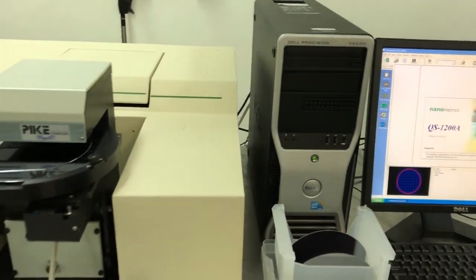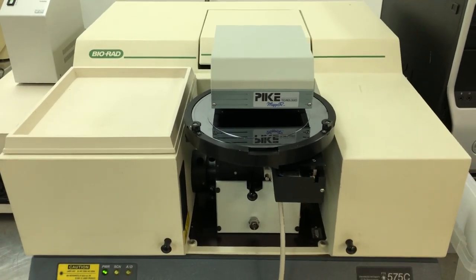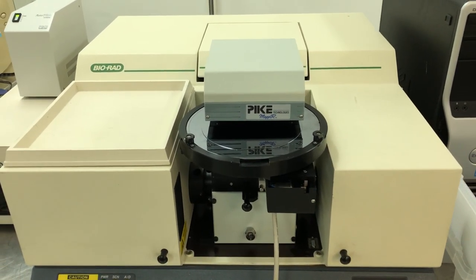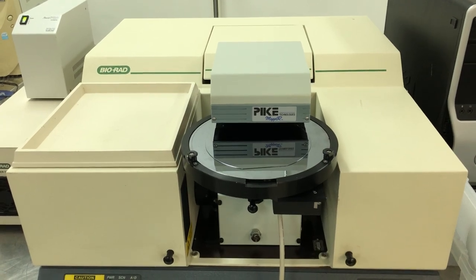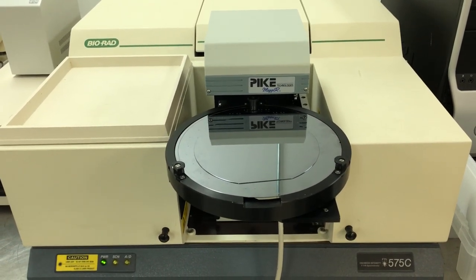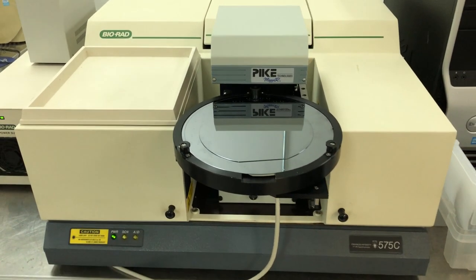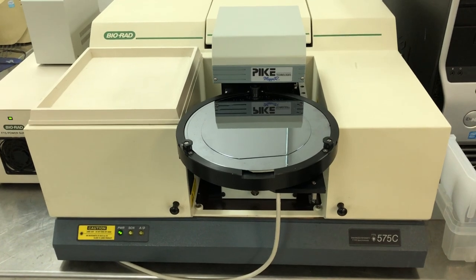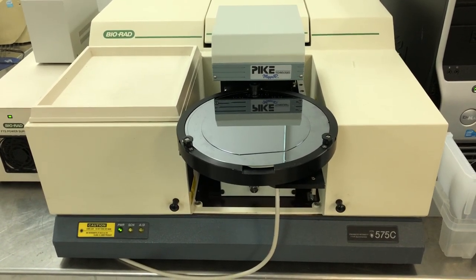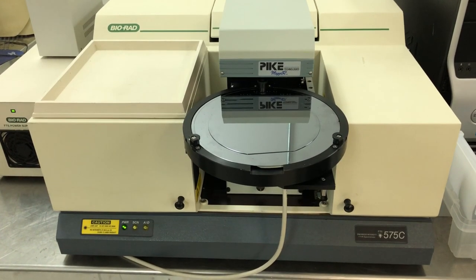Is it taking the reference reading now? No. This is the bare silicon reference wafer. Flynn's going to go ahead and we're going to start the measurement by taking a reading on the reference. It brings the stage out to the operator. What you can see is we've got a six inch collection of wafers and we're having to lay them on the eight inch wafer on the stage.